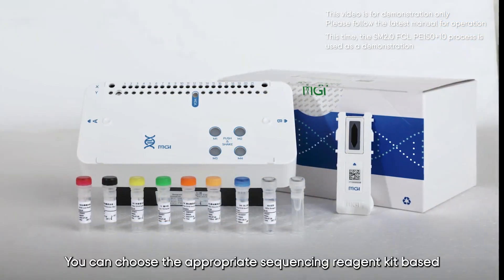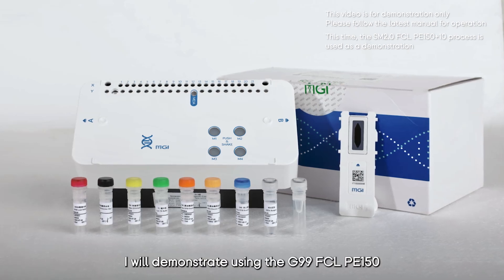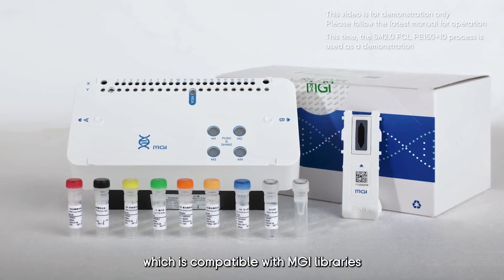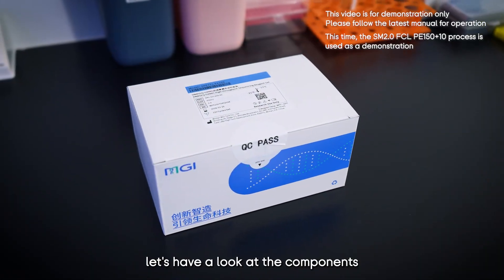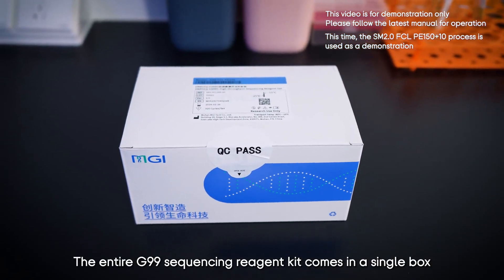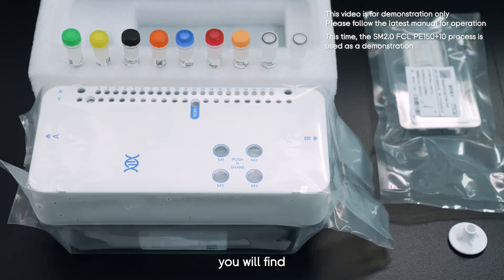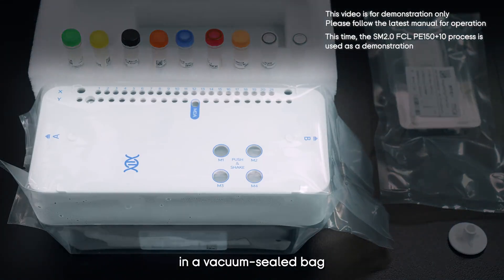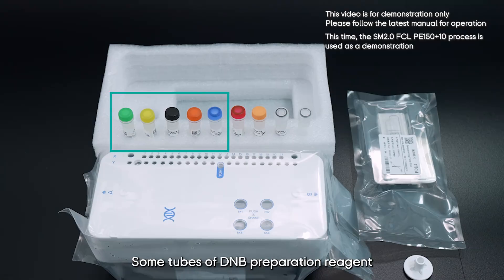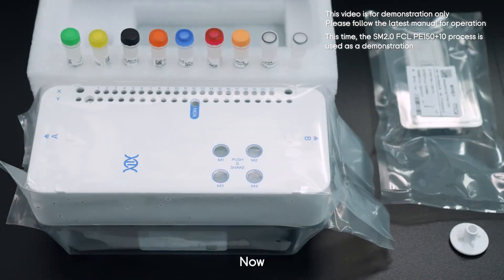You can choose the appropriate sequencing reagent kit based on your application. In this video, I will demonstrate using the G99 FCL PE150 sequencing reagent kit, compatible with MGI libraries. The entire G99 sequencing reagent kit comes in a single box. Upon opening, you will find a sequencing reagent cartridge in a vacuum sealed bag, a sequencing flow cell, tubes of DNB preparation reagent, two tubes of PE sequencing reagent, and a puncher.